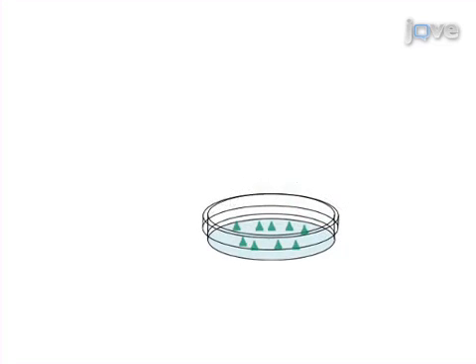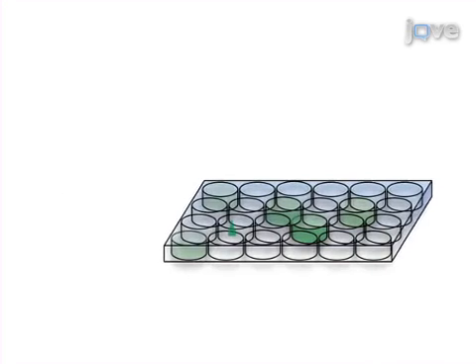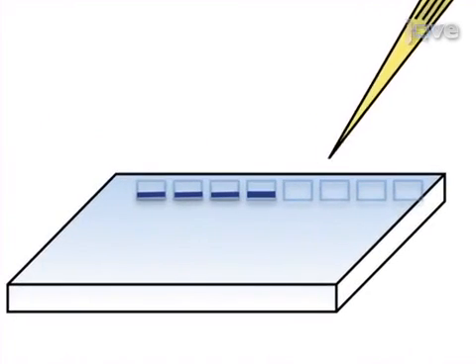The final step is to pick resulting colonies that will have grown after 2 to 3 weeks incubation in constant blue light. Ultimately, selection in liquid medium and subsequent molecular analyses such as PCR and Southern blot are used to show successful integration of the construct into the genome of the generated transgenic lines.